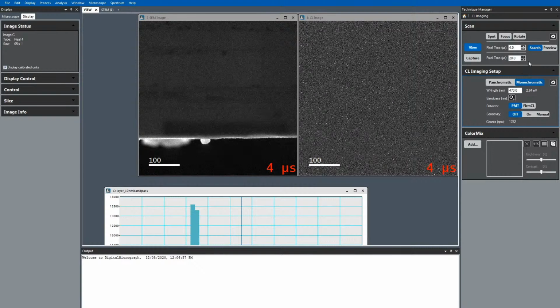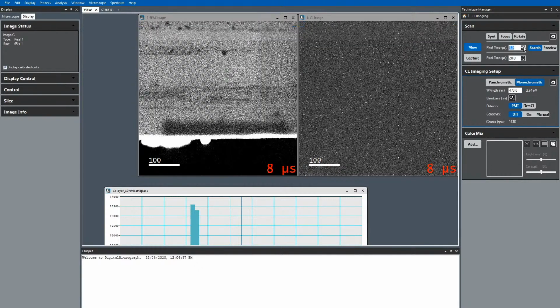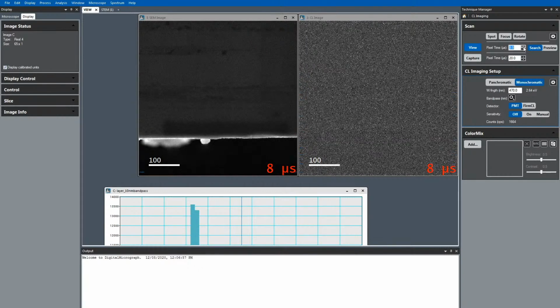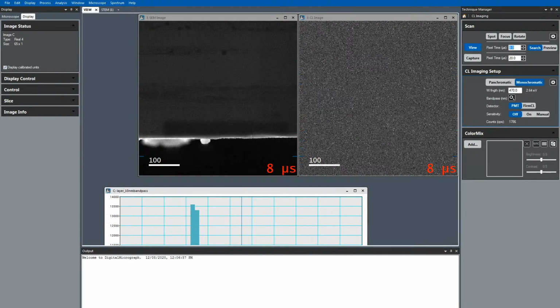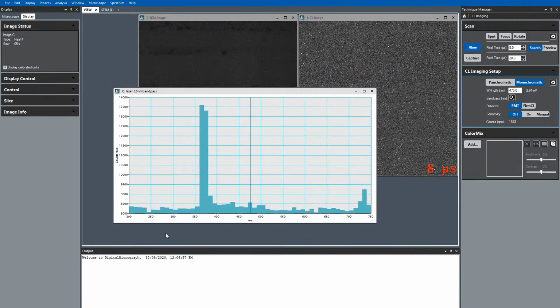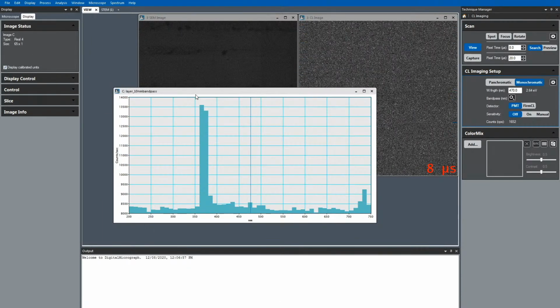And at 470, not much of anything. So that is likely a background peak, even though it's possibly statistically significant.